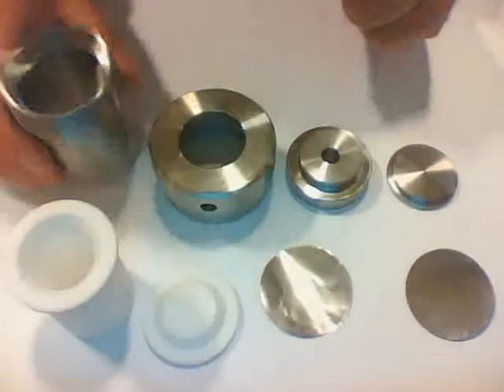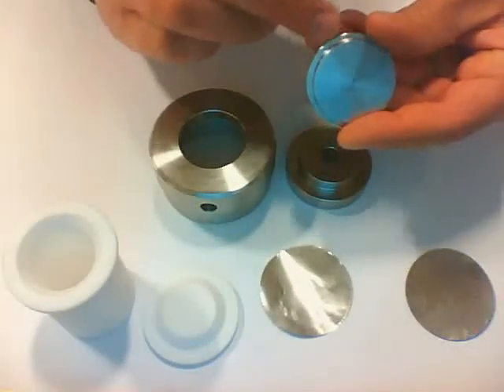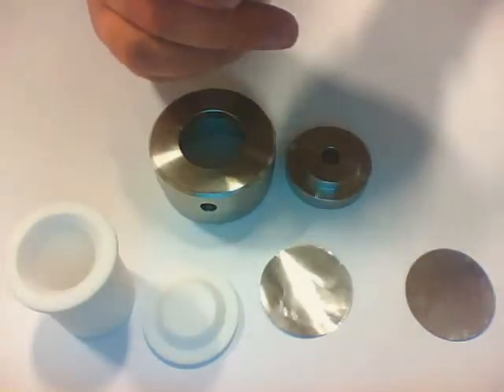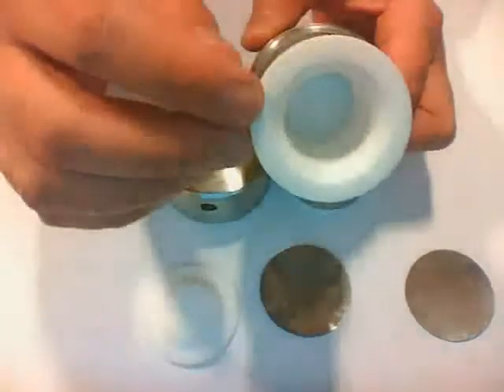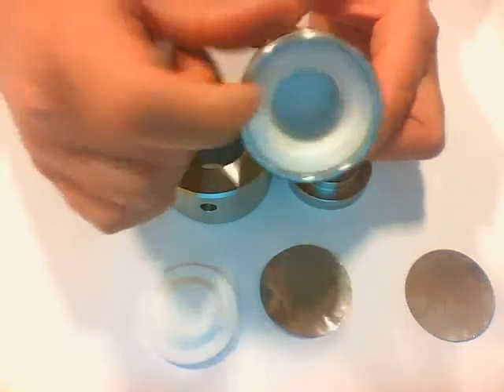To assemble the setup, we have the main body and the base. You can see the base has a cutting, and this has to face the correct way inside the main body. So I put it inside — it fits nicely — and then I can insert the teflon insert, which fits very snugly and goes very tight.